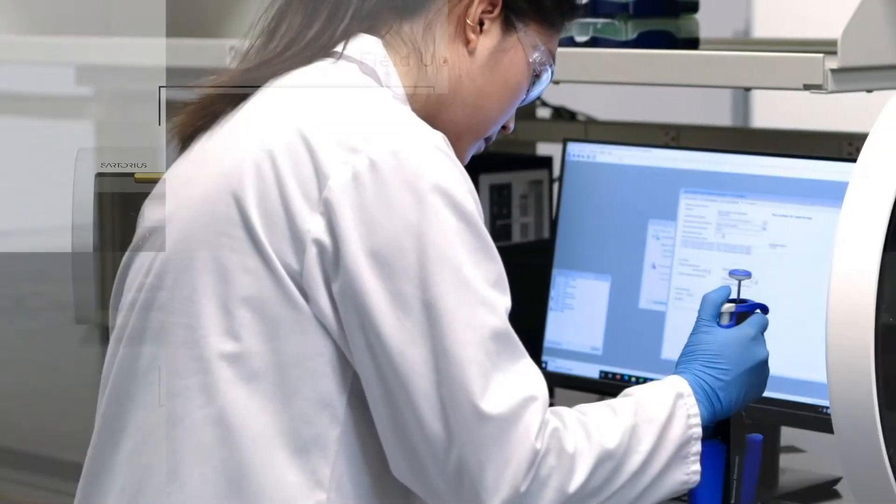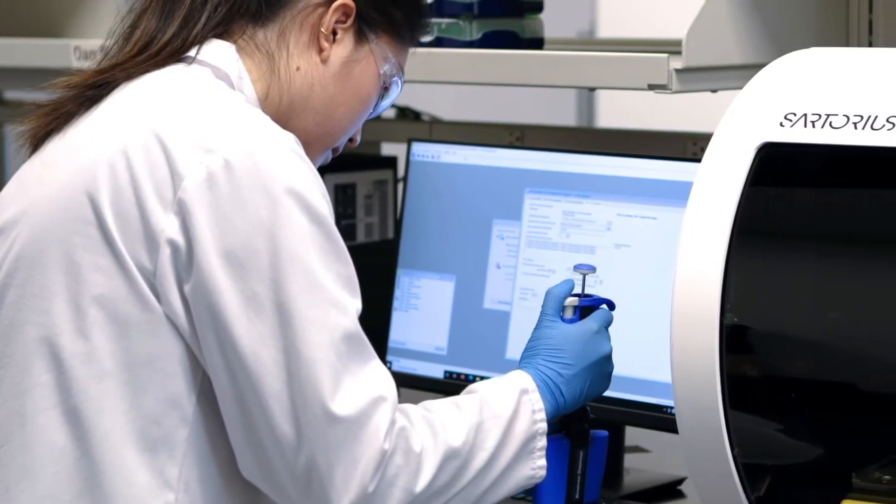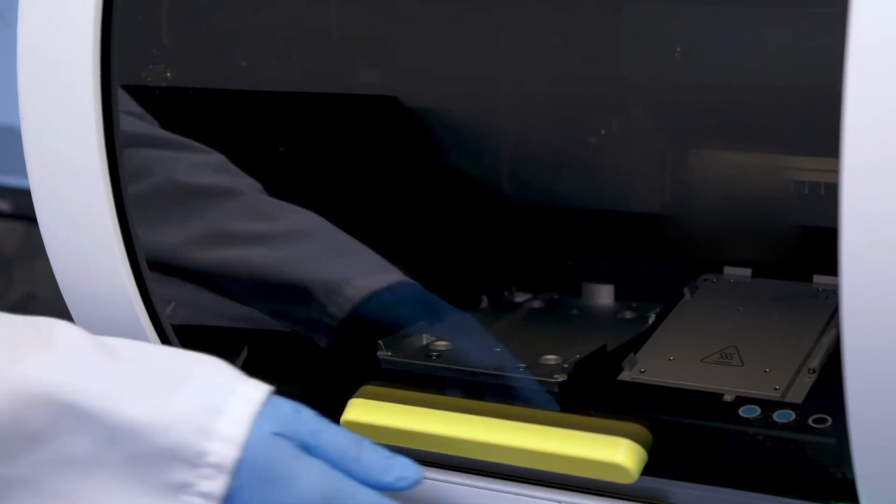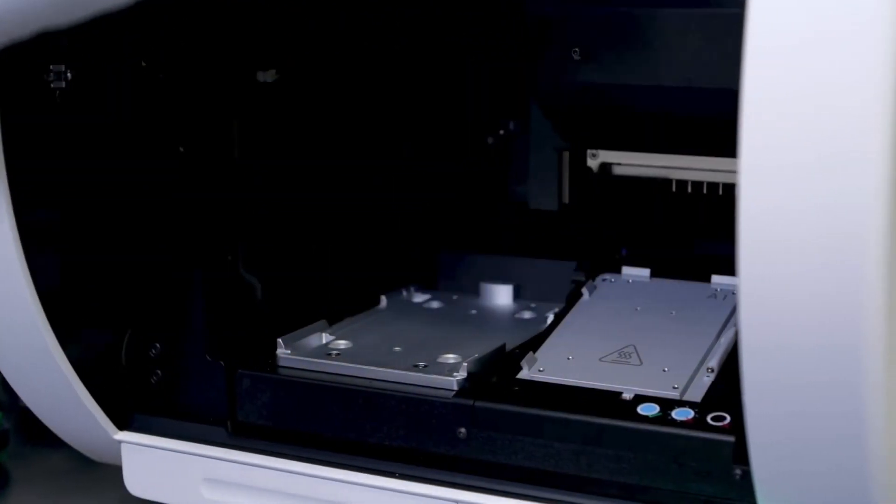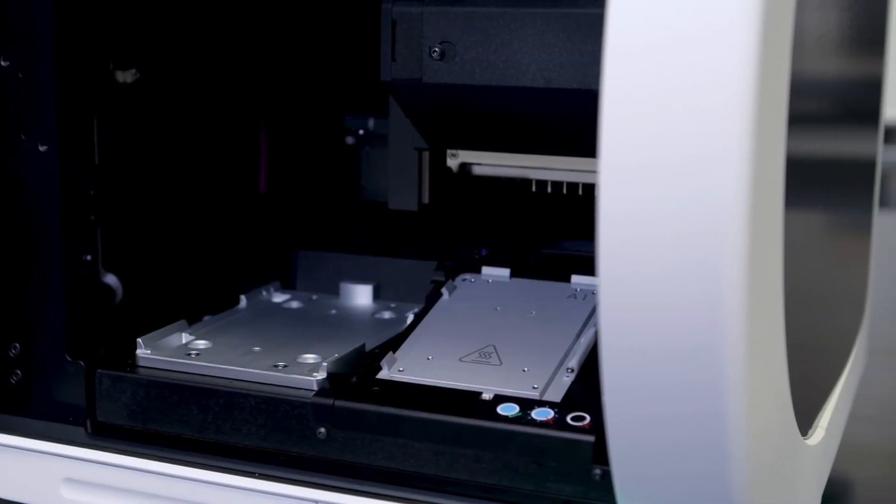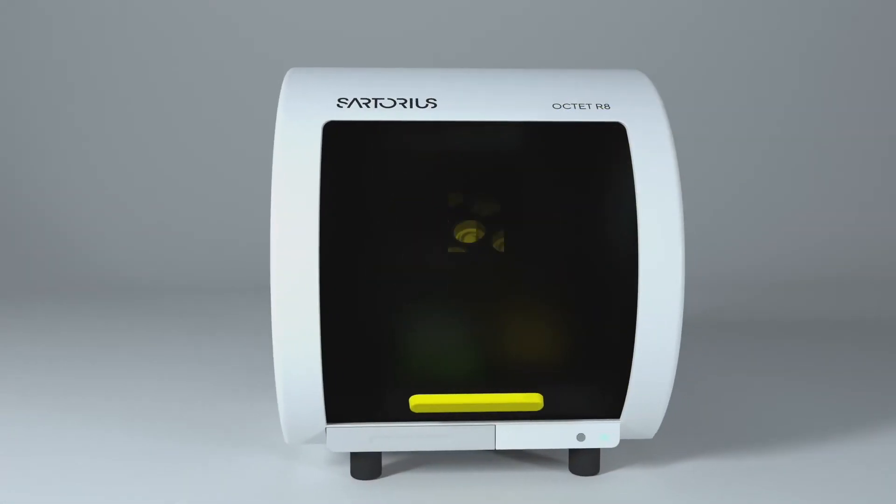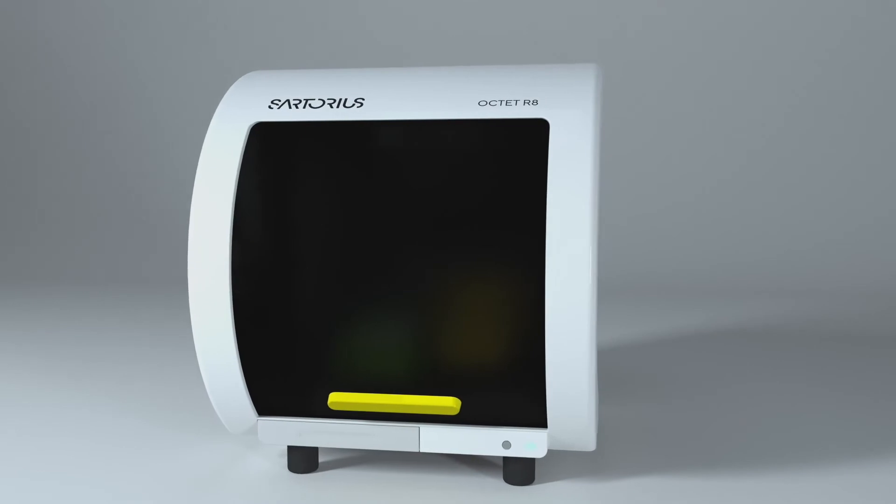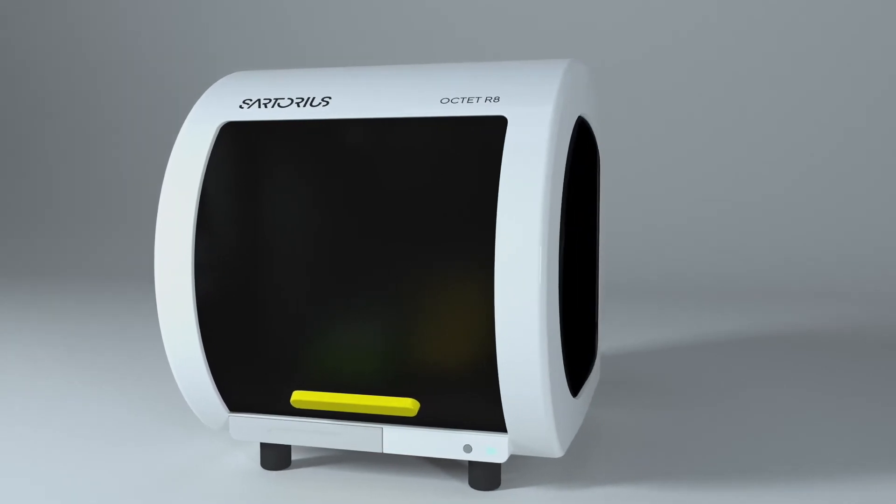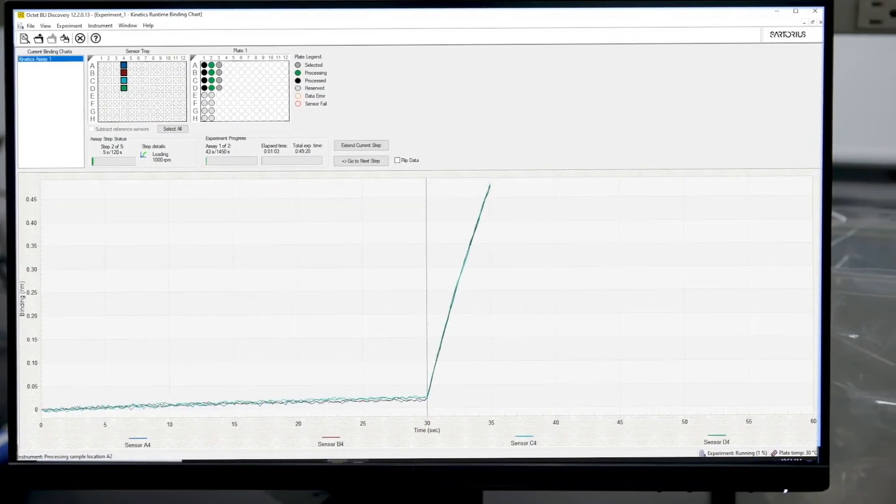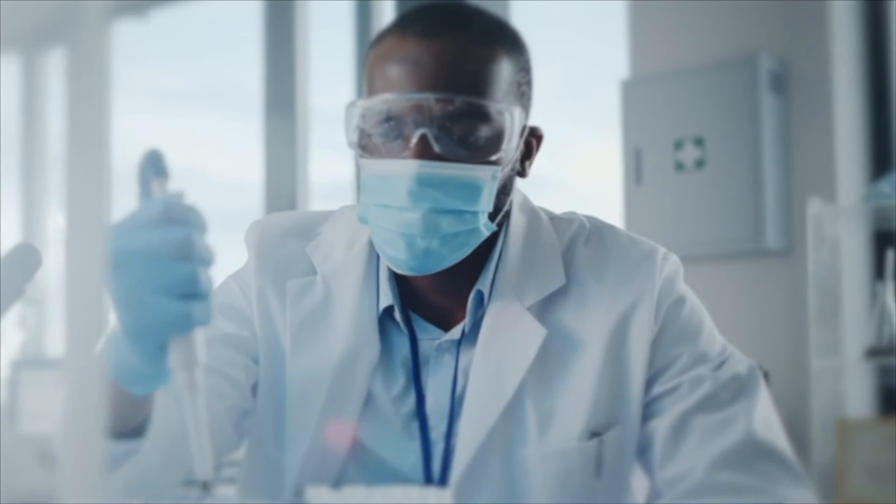For example, an Octet-R2 system can be converted to an Octet-R4 in the field, doubling your throughput instantly and offering the perfect balance between performance and price. You can even upgrade to an Octet-R8 to further increase throughput without the instrument ever leaving your lab. This helps to protect your investment and future-proof your workflows without the need to redesign assays and protocols as throughput increases.